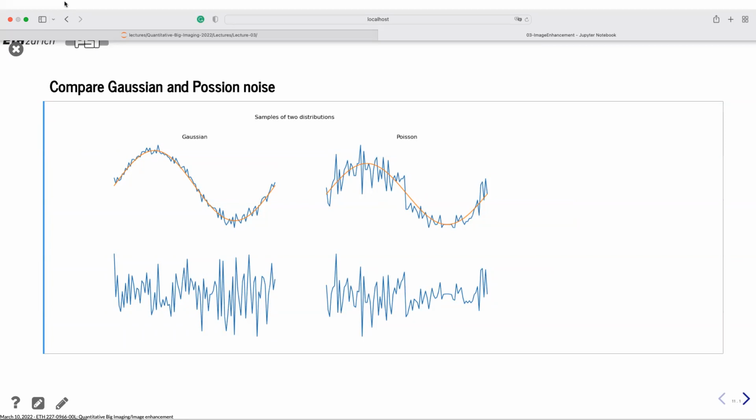It's a little bit difficult to compare now, because unfortunately the amplitude in this area is lower. But they should have a higher amplitude in this region than in this region.